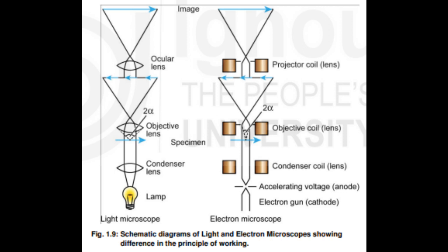3. Electromagnetic lenses are arranged together. They help in illumination, focus, and magnification. The condenser lens controls the electron beam. Objective lens, intermediate lens, and projector lens work together to produce a final image. Fig. 1.9. 4. The photographic system is used to record the image as an electron micrograph.